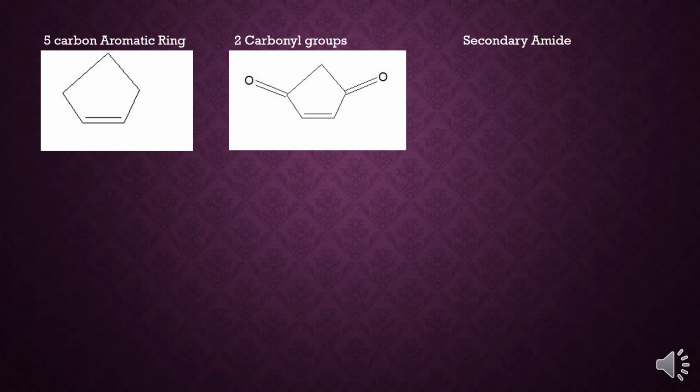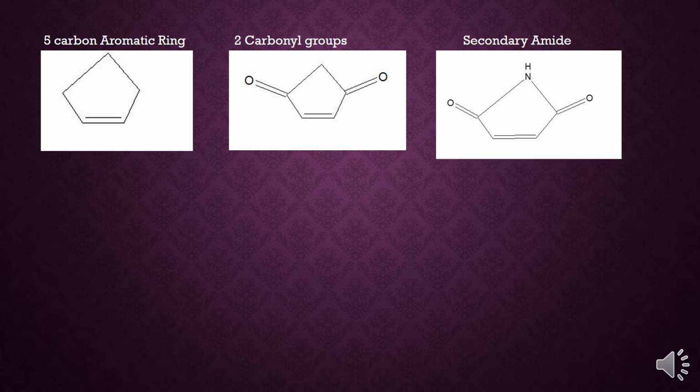Now, I'm going to substitute it in for the one up top, and this is why. On the 2 highlighted, you would have a double bond to that nitrogen if it were placed in one of those positions. Nitrogen is not very fond of double bonds. It would rather form single or triple bonds. So it would rather stay up top where it can form single bonds to each of the carbons, as well as the hydrogen. Which still leaves your methyl group, but now you have the additional carbon you needed.